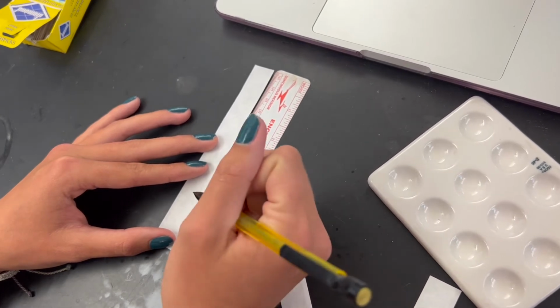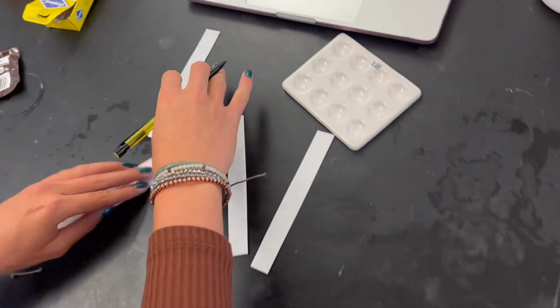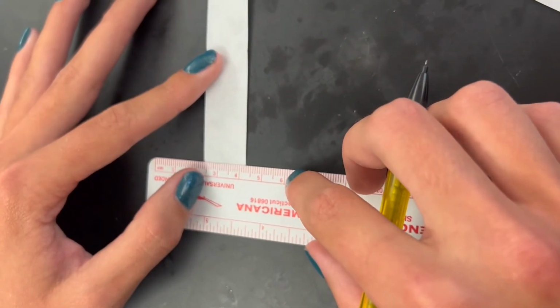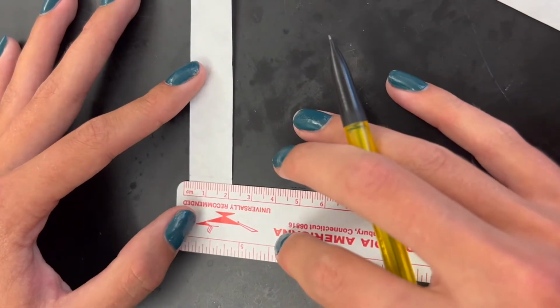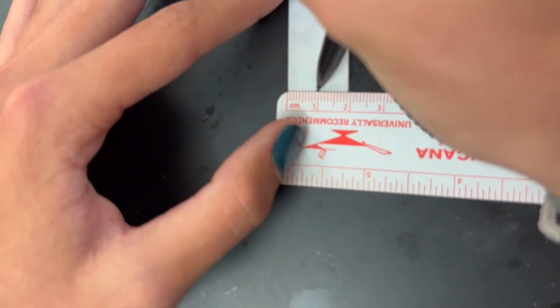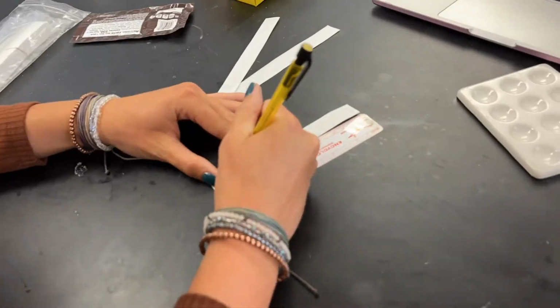To begin, you want to measure 15 millimeters from the base of the strip on both sides and then faintly draw a line across. The next step is to measure 9.5 millimeters from the edge of the paper along this line and mark it faintly with a pencil. This is where you will place your dye sample. Repeat this process for 2 more strips of paper.